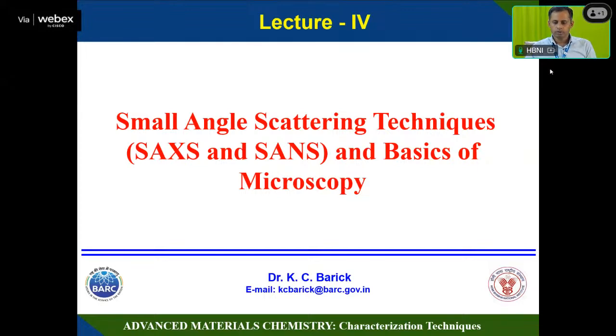Good afternoon. So today we will discuss two techniques, mainly small angle scattering techniques, that is small angle X-ray scattering and small angle neutron scattering, and a little bit about the basics of microscopy. So far we have discussed mainly X-ray based diffraction techniques and neutron diffraction techniques. So today we'll see the scattering techniques.